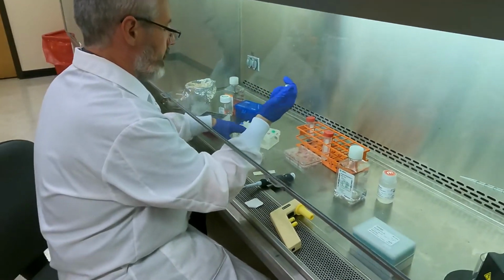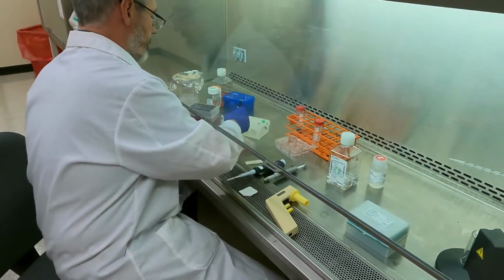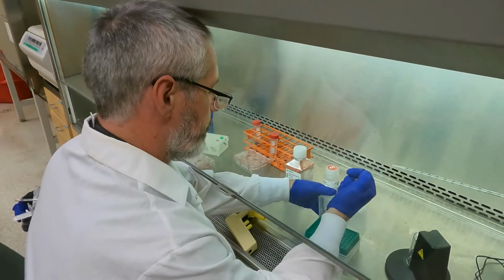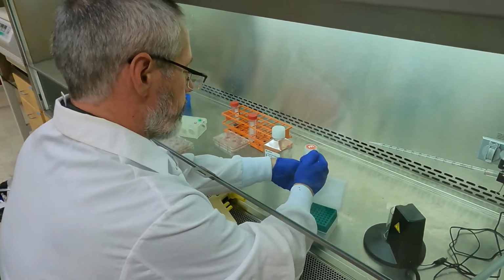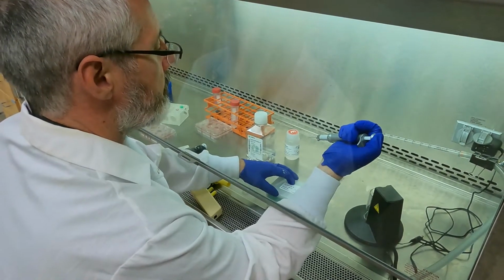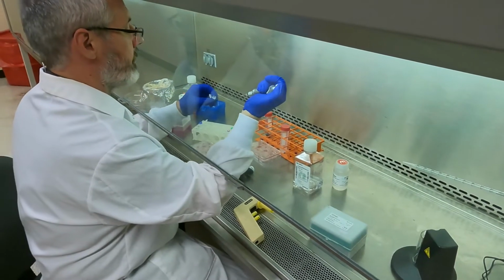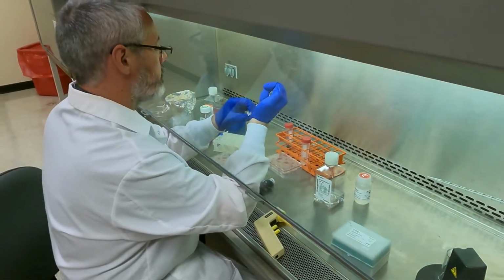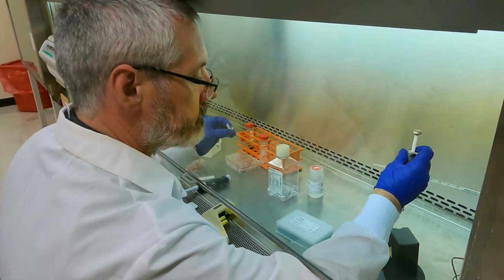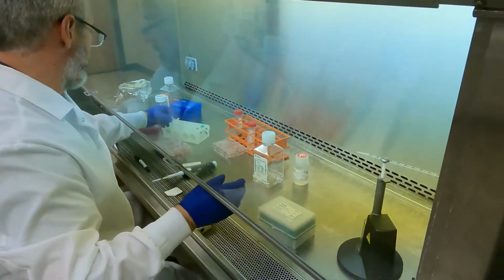A little bit worried about that one. I think I touched the top by accident. I should not have done that. Just mark that just in case it gets buggy or something. That was a bit of a mess up. I just touched the top of it. I'm not sure if that's completely sterile. Okay, fine.